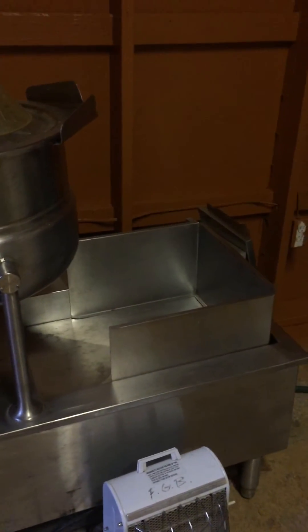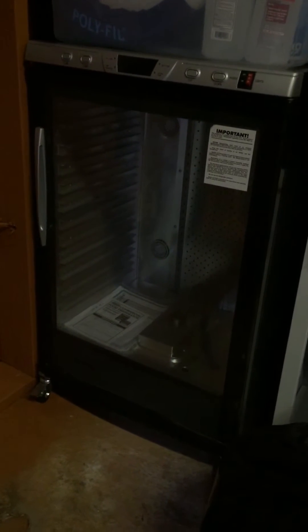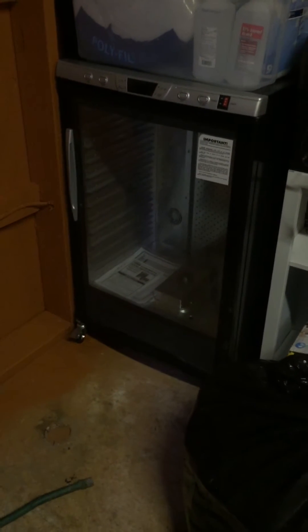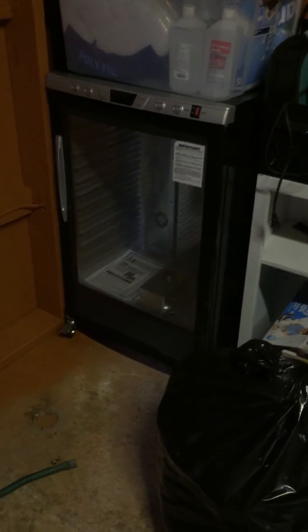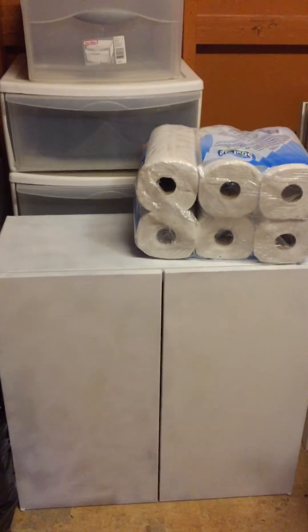Eventually it will also probably do a little steam sterilization — low-pressure sterilization room. We also picked up this commercial dehydrator. It's 160 liters so we can do quite a bit of drying, 24 racks. We got this off Craigslist for 300 bucks — normally sells for a little over five hundred plus shipping.